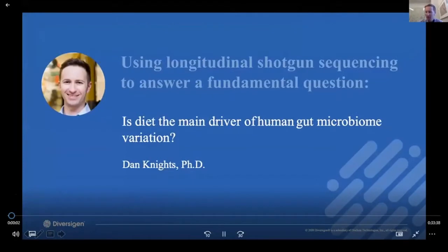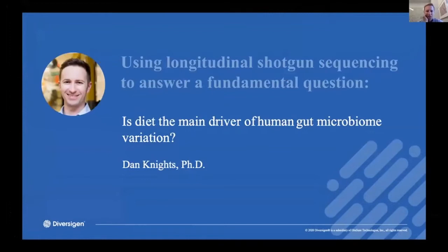Okay, well, thanks, Lisa, for the introduction. It was very kind of you. And so, I'm really happy to be able to talk about some of these aspects of microbiome analysis with Joe. I think there are going to be some interesting overlaps between the things that we're finding in different studies that will be informative. And what I'm going to talk about is really the big picture: using shotgun sequencing and longitudinal studies to get a lot more power out of microbiome science.